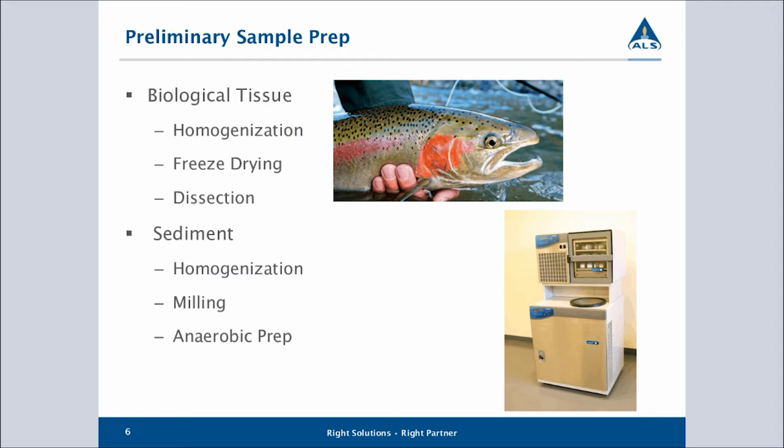Another common application is when prepping sediments for sulfide determination: acid volatile sulfides, total sulfides, reactive sulfides. We're always worried about the loss of sulfides due to oxidation when you're doing preliminary handling of a sample.